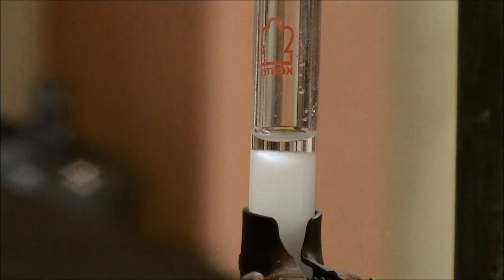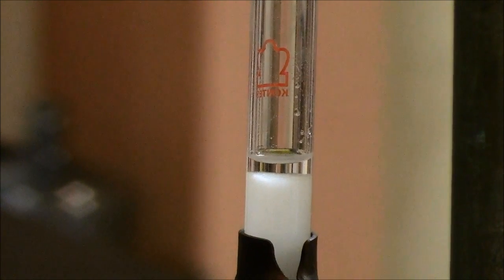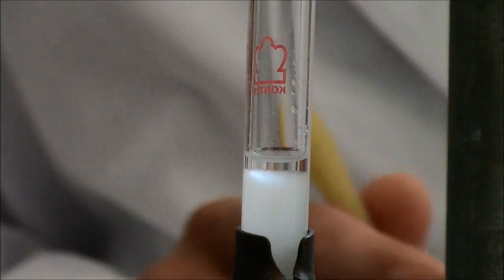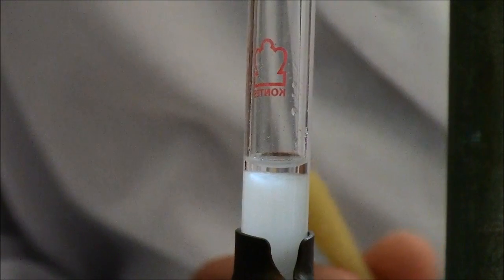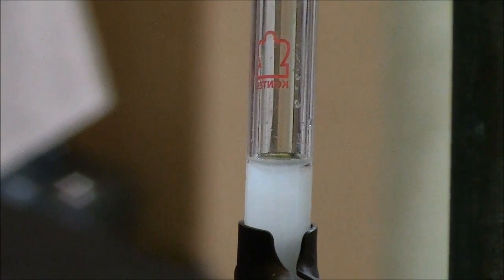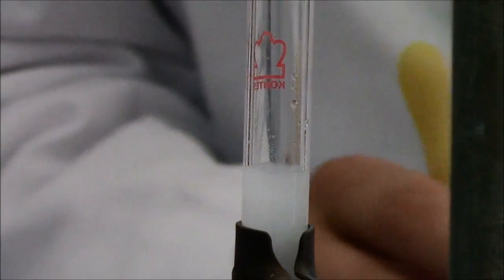This is 300 microliters of sample loaded on top of the column, and we're about to drain it into the actual silica. So when it was all one, here we added 3. We put it in there, we separated into top and bottom. We added 1. Okay, that's it. Alright, so sample's now in the silica.